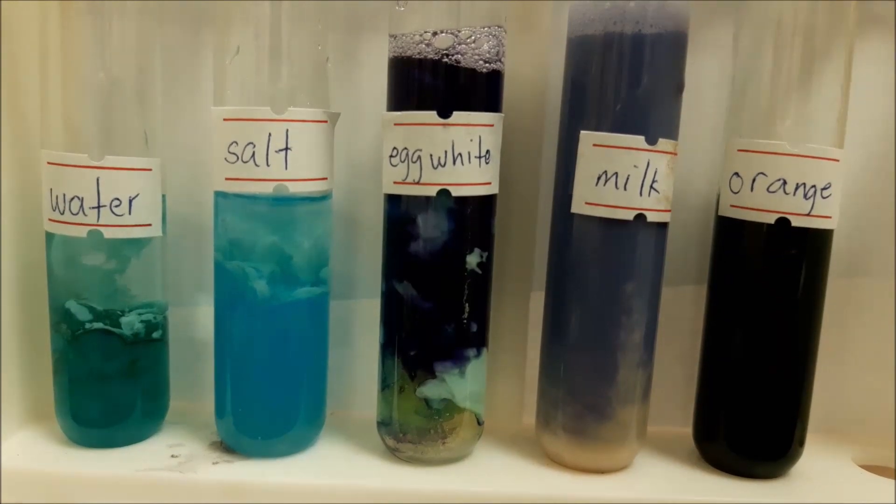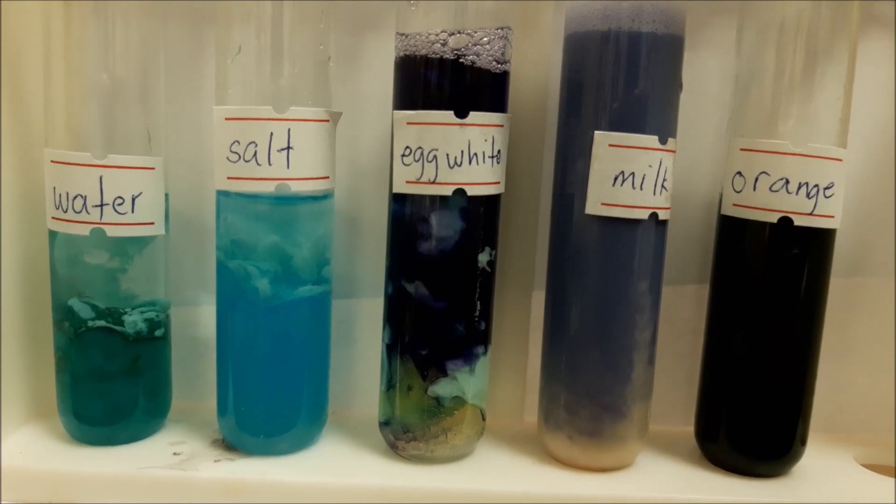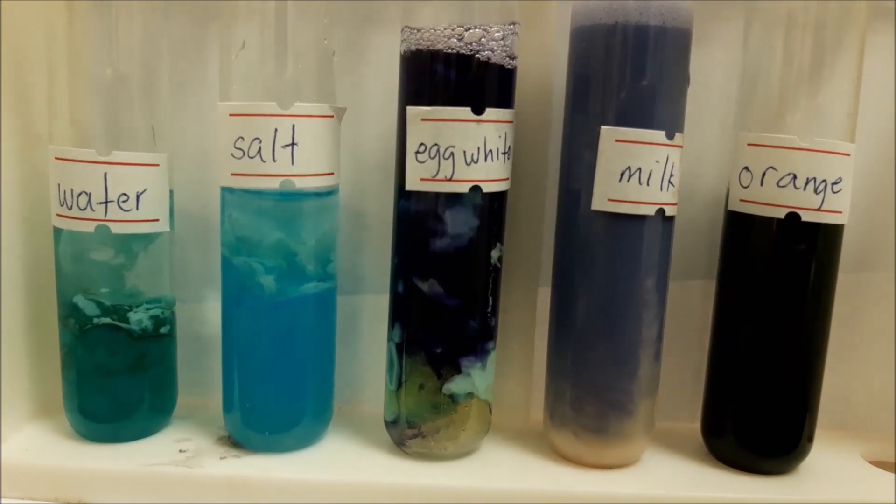So from this experiment, we can see that the egg white and the milk turned purple. So it means these are the food items that have protein.